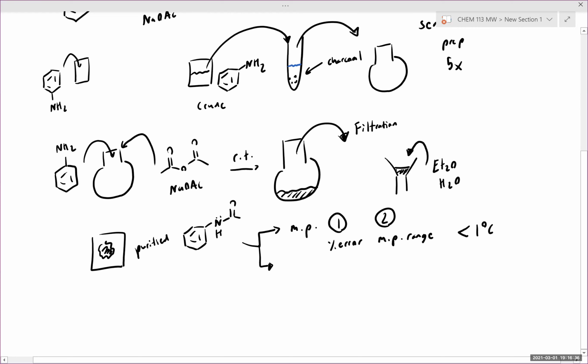The next thing that we're going to collect in this case is an IR spectrum. The IR spectrum will be collected in Nujol. What I would note is even if you have a literature spectrum in KBr, you won't see anything significantly different. The only thing about Nujol is that because it is a hydrocarbon, you will see the CH sp3 signals pretty broadly in Nujol.